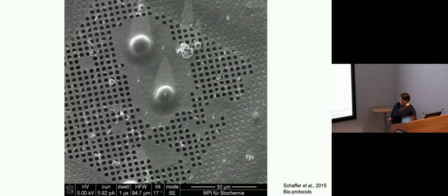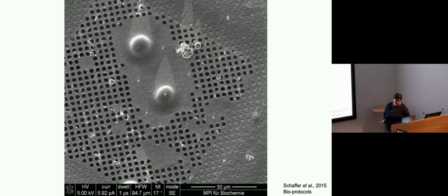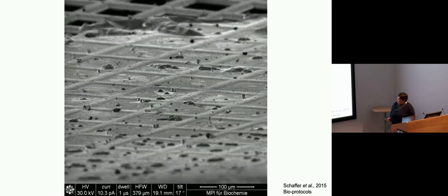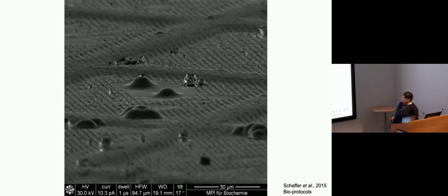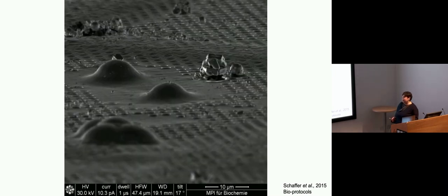The first step when setting up is to select your target for milling. What we're looking for here is cells that are isolated, so not clumped together and also not on the grid bars but relatively central in the grid square. Then we need to find the same cell in the ion beam, find the coincidence point of the two instruments and then set up these milling areas. You can see the quantifoil disappearing and milling away in the ion beam.